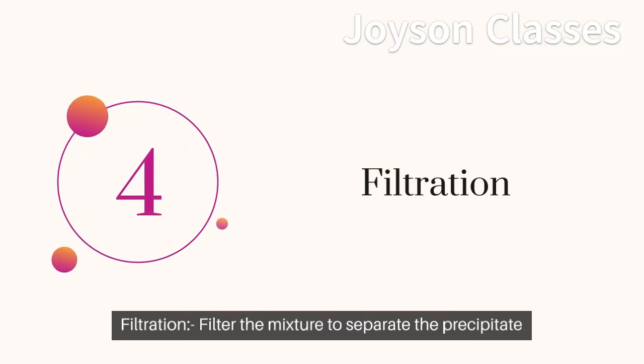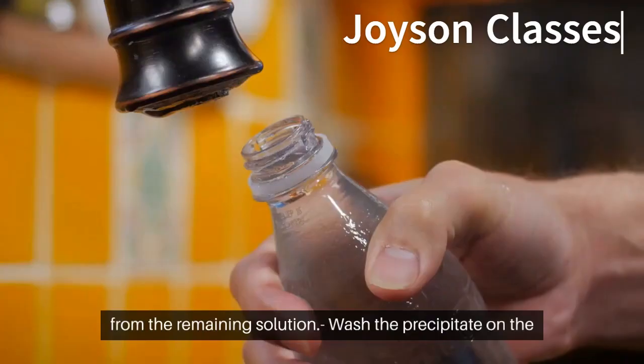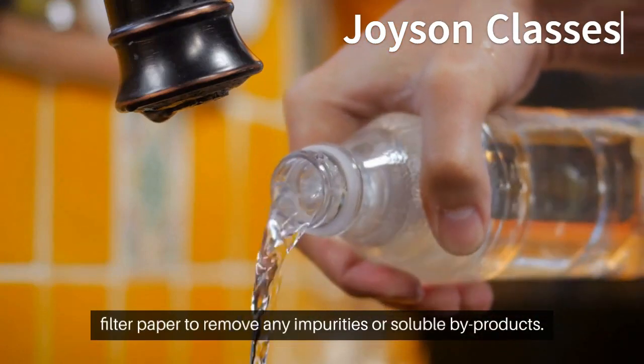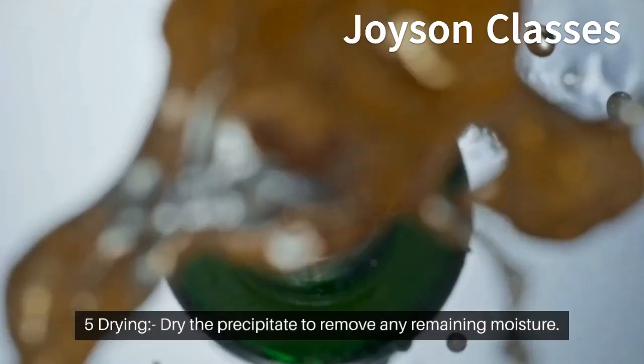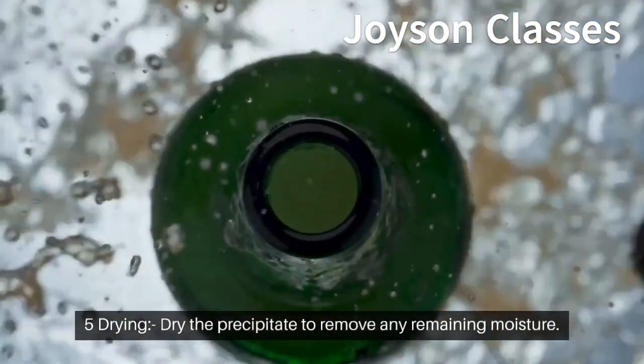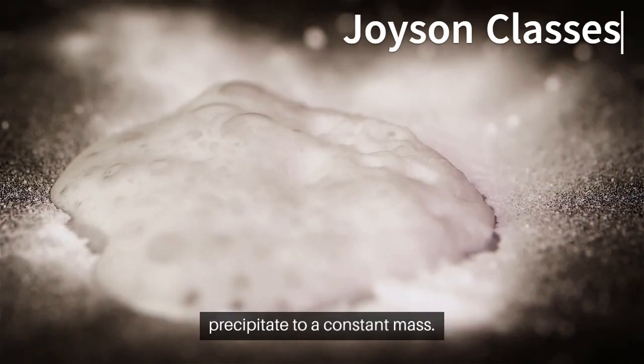4. Filtration. Filter the mixture to separate the precipitate from the remaining solution. Wash the precipitate on the filter paper to remove any impurities or soluble byproducts. 5. Drying. Dry the precipitate to remove any remaining moisture. This is typically done by heating the filter paper and precipitate to a constant mass.